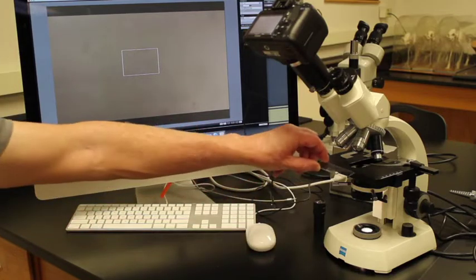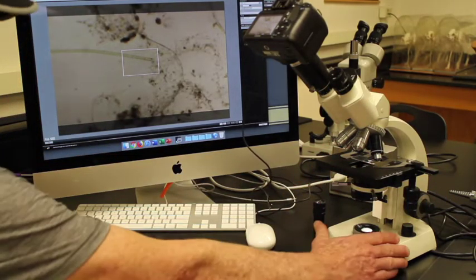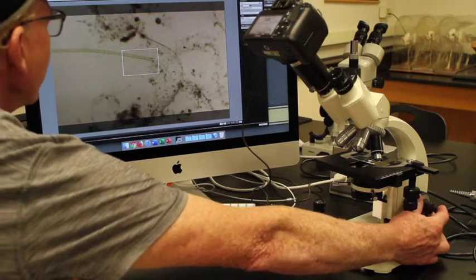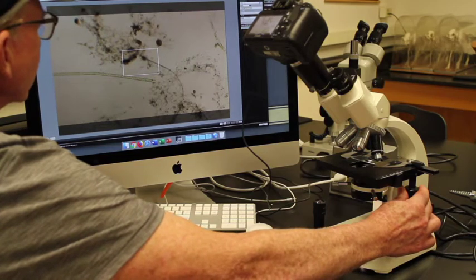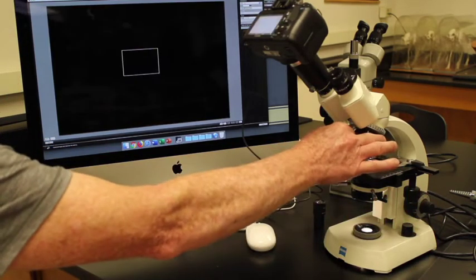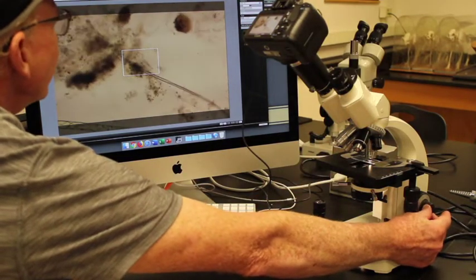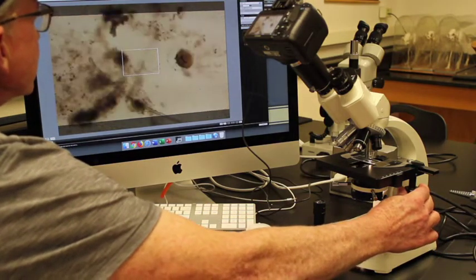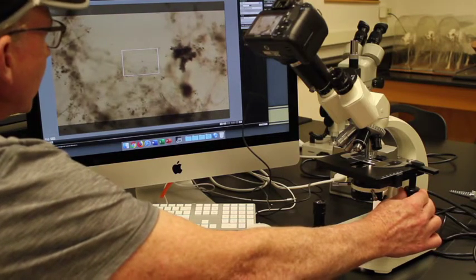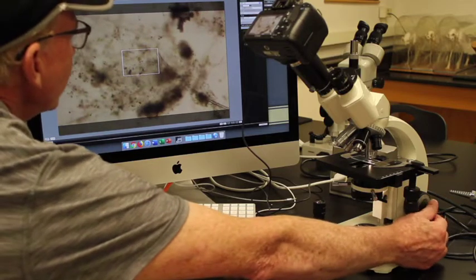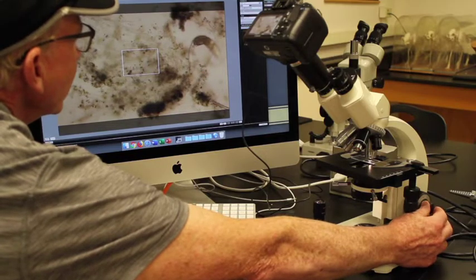Here's a slide that I made up. This will be one of the slides that we'll be looking at later in lab. We'll throw it in here so you can see what's going on. We'll focus it, move it down a little bit, put some stuff in the center that looks cool. Then I can easily switch to a higher magnification, focus it, and center the object.